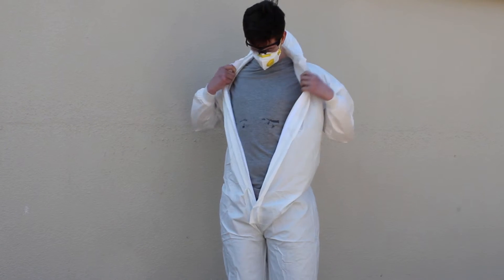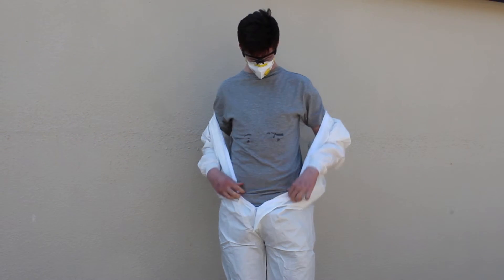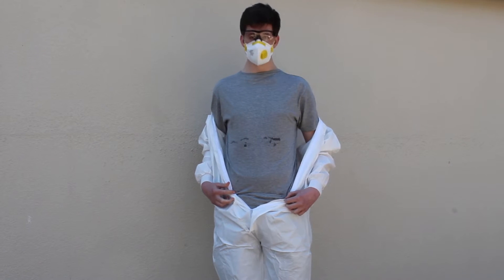Also notice how little liquid penetration there is through to the wearer. The lines of moisture you can see are actually penetration through the stitched seam, not the material.